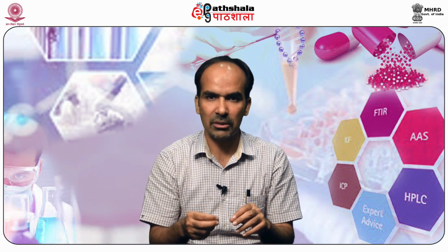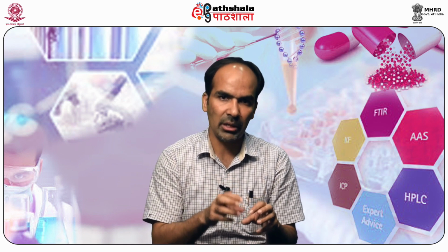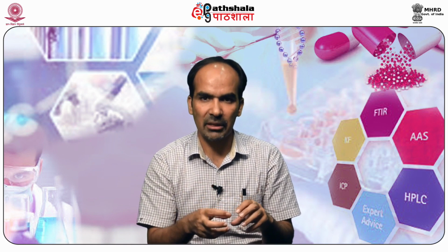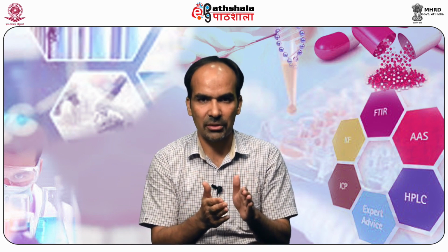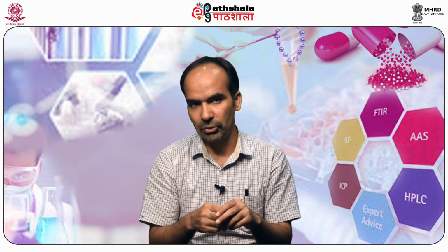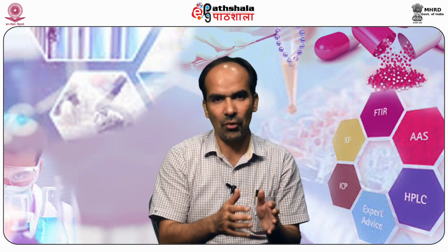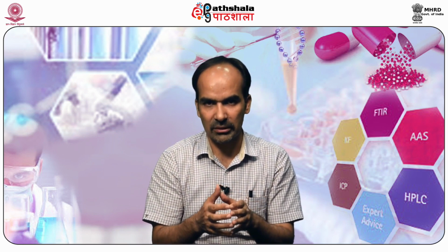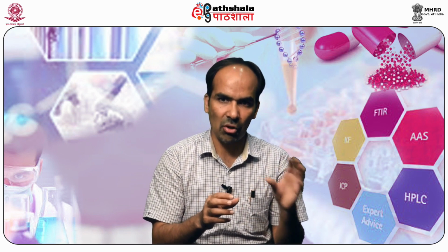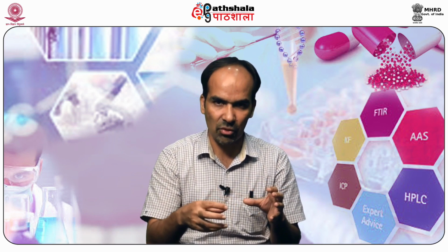The fluorescence spectrum is characteristic of a substance which exhibits the phenomenon of fluorescence. The emitted light ceases or stops when the exciting light, which usually is a UV light, is removed. A fluorimeter is an instrument which is used for recording this fluorescence phenomenon. It consists of a strong UV light source. As I told you, this process starts with the strong UV light.